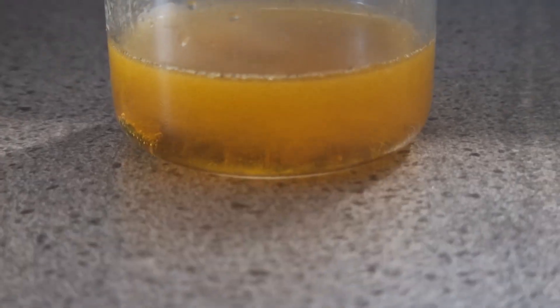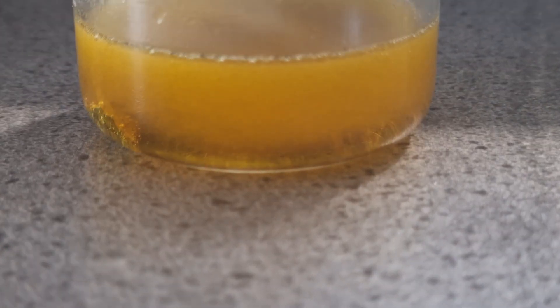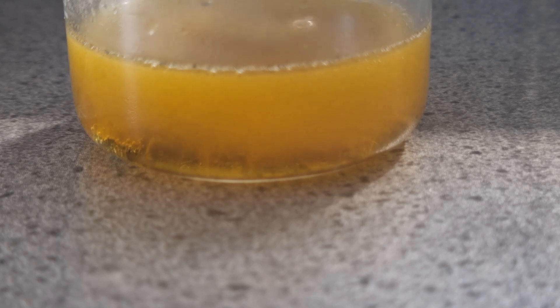First, the solution goes from orange to a golden yellow color. This color is also associated with the chromate ion, and yet the conditions are still acidic, as evident by the zinc metal bubbling away.